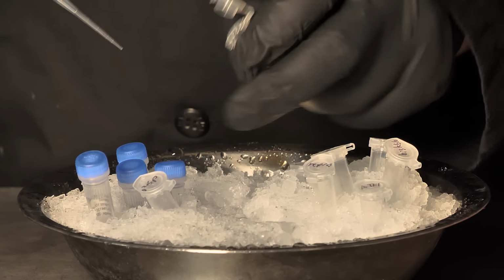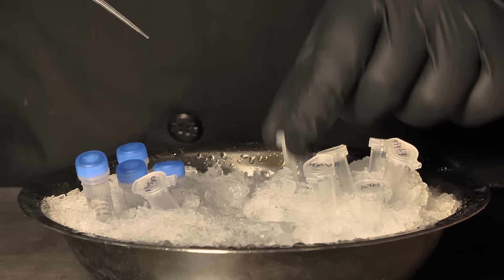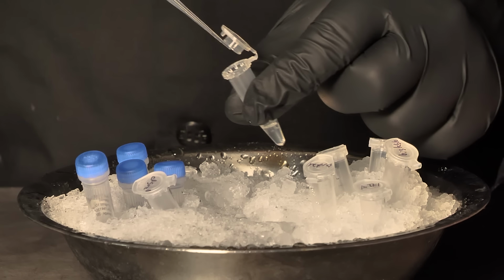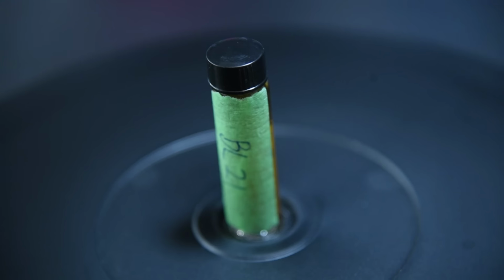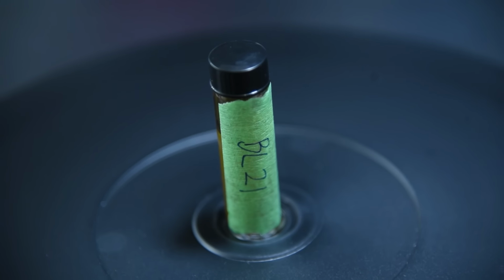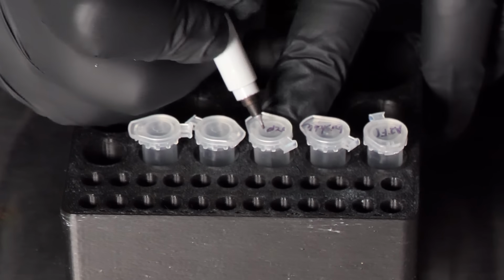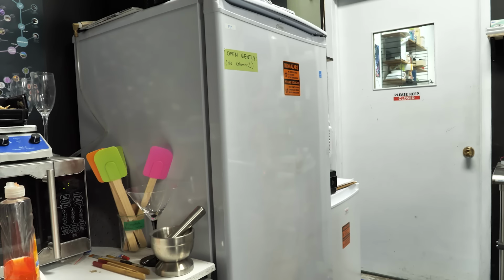Speaking of which, I'm going to go ahead and do a bunch of tubes at once, since we went to the trouble of making a big batch, but each of the tubes will have a different piece of DNA added to them. To each of the tubes, I've added about 100 nanograms of their respective DNA. But if you're using a stubborn strain like BL21, you can increase the DNA concentration up to 1 microgram. And of course, be sure to carefully label each of the tubes, as it is impossible to know what these tubes are otherwise.